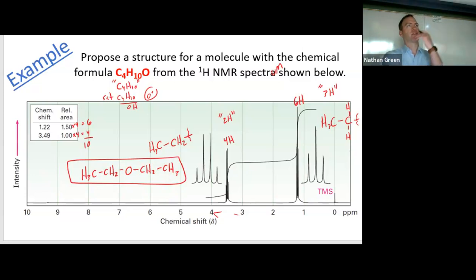You walk up to a fine art piece and you stare at it for a while and you're like, I see the future. And then maybe somebody else walks up and they're like, what are you talking about? It's a cow in a field. The future, you look, and flies maybe, right? Don't look at an NMR like a painting. If you just look at it and then say, ooh, I see this molecule, you will convince yourself that's the molecule. You will draw crazy things and you'll spend forever trying to make your molecule fit the spectrum.